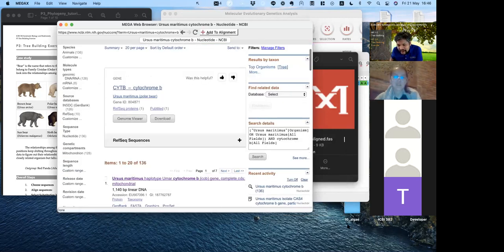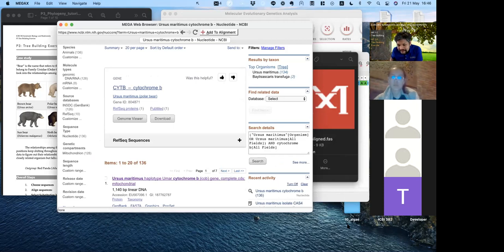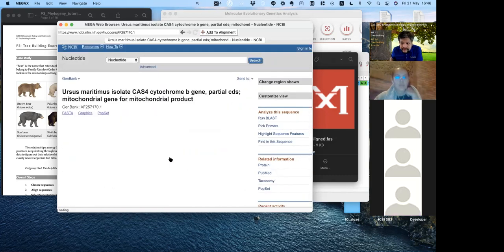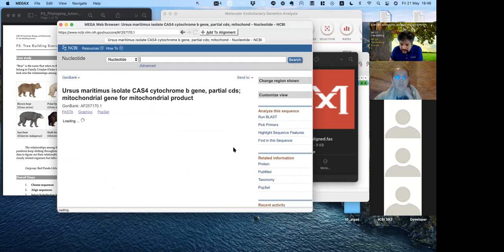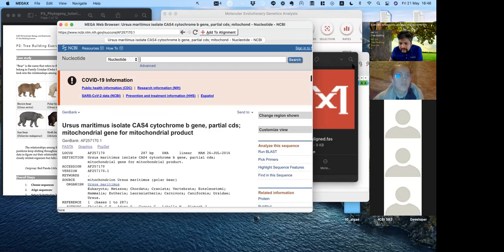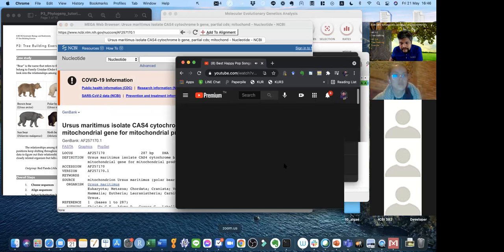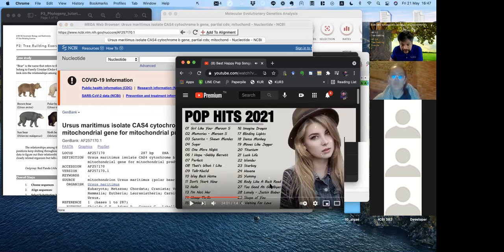Yeah, I probably should do that. I'll do that next time. A text file is useful, I agree. We just open a new text file and copy paste. I think that's much faster compared to using the website and waiting for it to download. I'm sure the browser is faster if you open it from outside. Yeah, I agree.